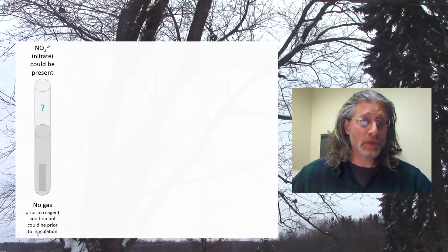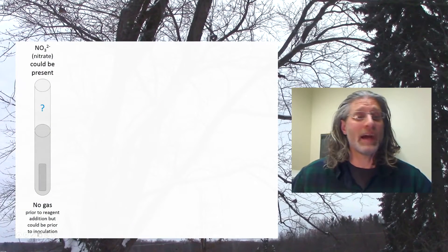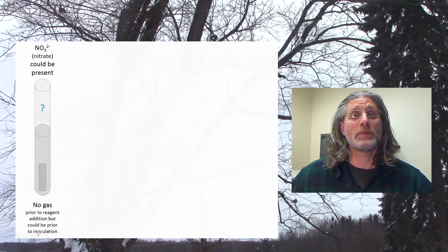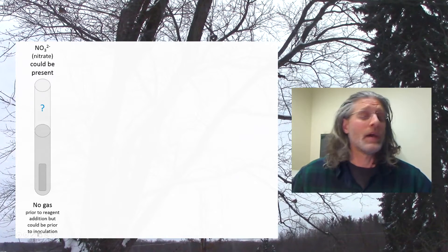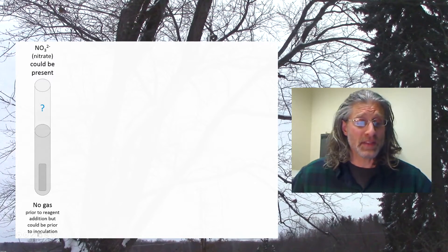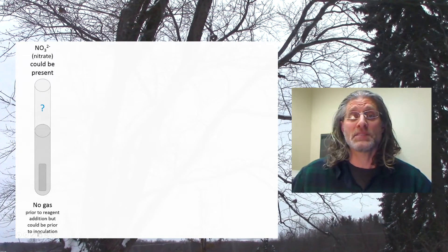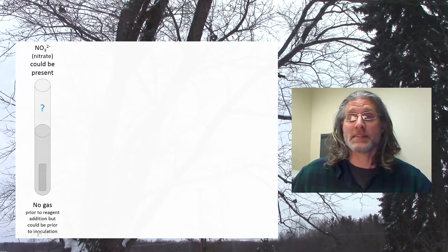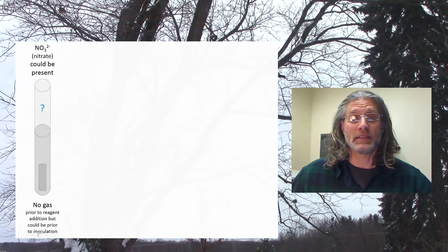The first tube shows either an un-inoculated tube or a tube in which an organism has grown. You can see that there is no color reaction at this point, and there is also no gas that has been collected.